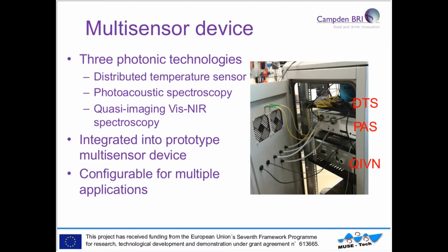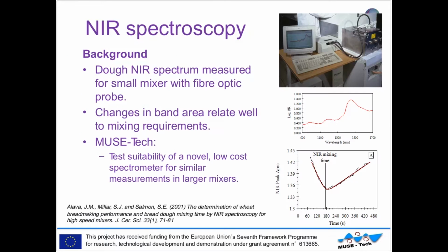I'm assessing it for baking, but other partners in the project have assessed for other applications. So first I want to talk about NIR spectroscopy, which is one of the methods that we have built into the sensor. A little bit of background on this.